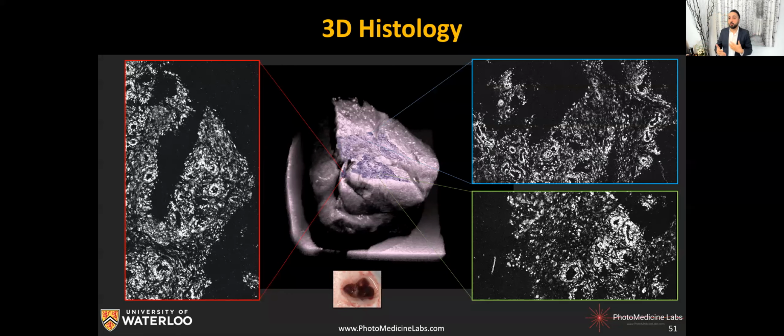So it's important for us to be able to adjust our focusing capabilities, either by using adaptive optics or mechanical focusing or some optical tricks, to be able to look at different areas in resected tissue. And this is what we've done.